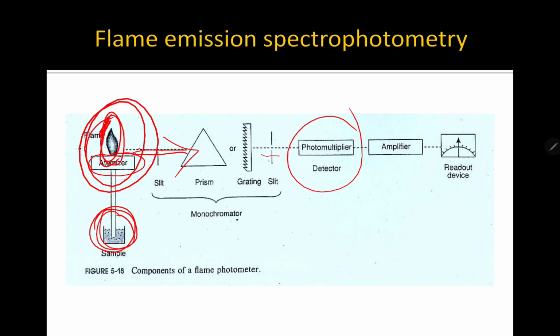But can you see the difference of this from your spectrophotometry? Kung sa spectrophotometry, you had your light source, diba? And then, meron kayong entrance slit, tama? And then, you also have your monochromators here, tapos exit slit, diba? Tapos, tsaka pa magkaroon ng sample. Dito yung sample natin, then photodetector, then amplifier kung meron, then readout. Here, you had your sample nasa baba siya, and then you are merely causing the electrons present in the sample to be excited. Depende kasi kung anong test ang gagamitin mo.